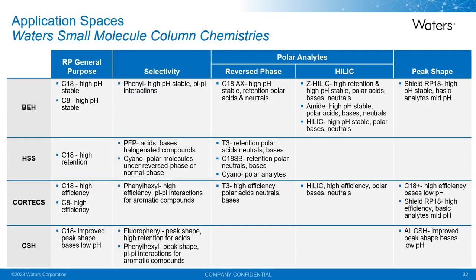For polar retention, which is always a hot topic, you have your choice of reverse phase, which is a little bit easier to implement than HILIC, but HILIC again is very powerful.